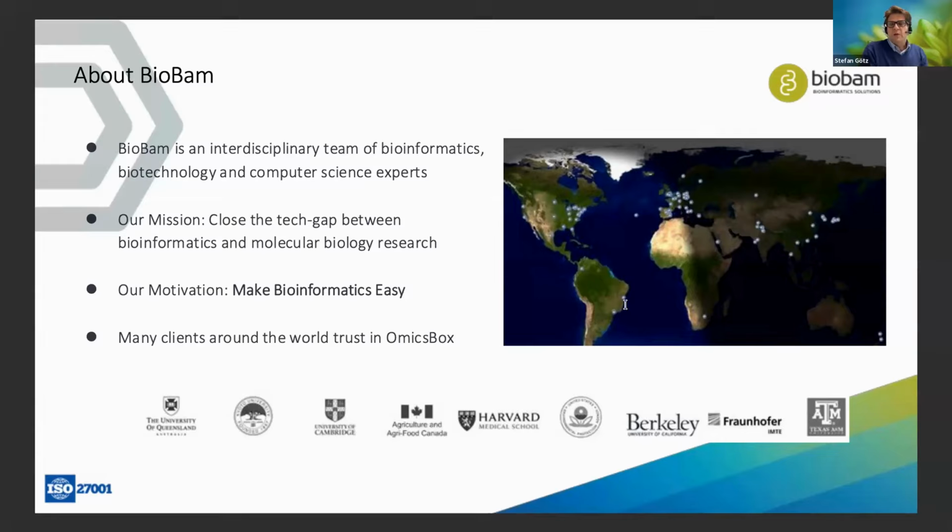On the other side, we have those computational experts who are taking care of visualizations, high-performance cloud computing, front-end, back-end issues, those kinds of things that make everything work smoothly.